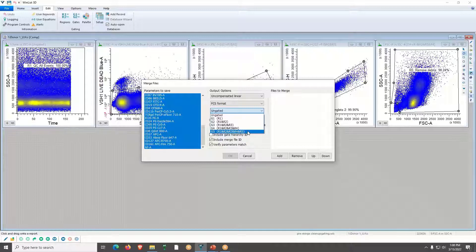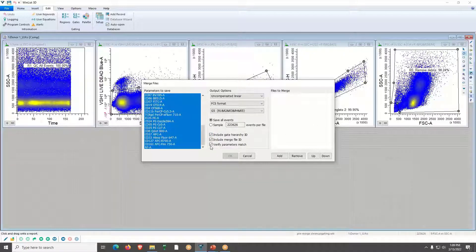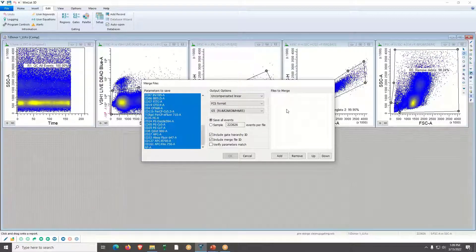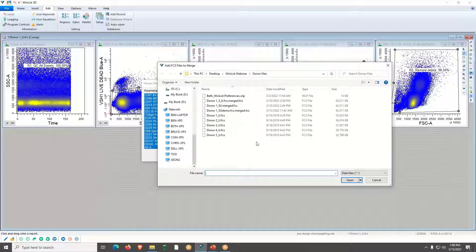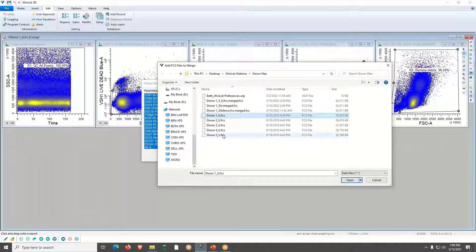I'll click on G5 and include the gate hierarchy in the merged files. I'm going to uncheck 'Verify Parameters Match' in case there are any differences between my files — if you keep it checked and differences exist, you'll just get a message asking if you want to proceed. Then I'll click the Sample radio button and change to 50,000 events per file. Now I'll add my data files in order — I have five different donor files.